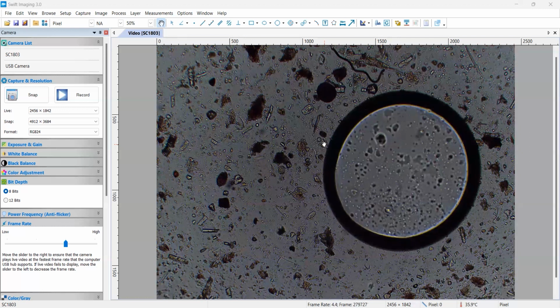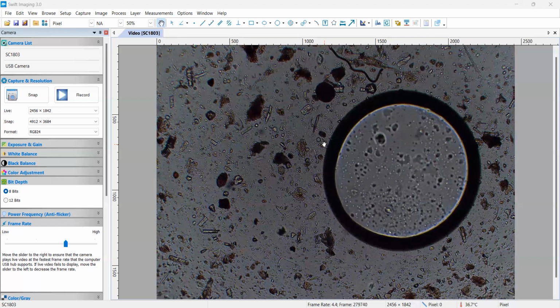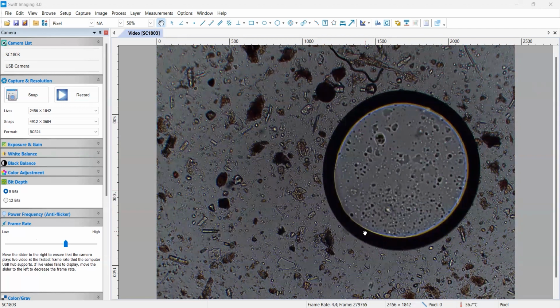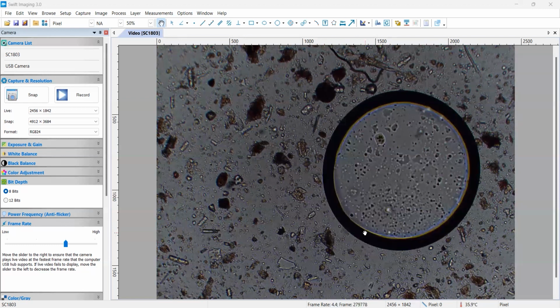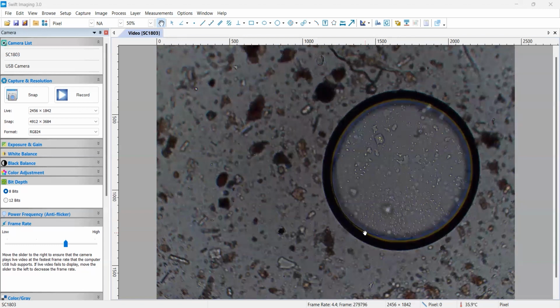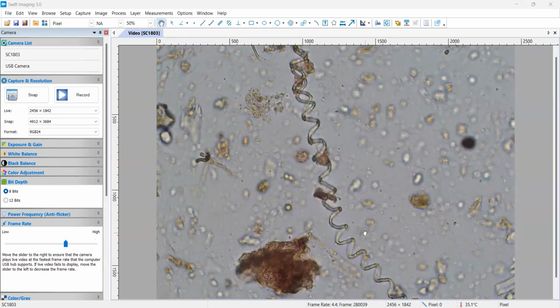Okay, here's something fascinating. So this is a piece of oil. So when you see this big thing with the big thick, and then it looks like that on the inside, this means that the slide I'm using, either the cover slip or the slide, was not cleaned properly. So sometimes you get a lot of these. If you're looking at a sample and there's a whole bunch of these, start over, clean your slide right, or else those guys will get in your way. Okay, hopefully this helps you to find cellulose in your hot compost under a microscope.